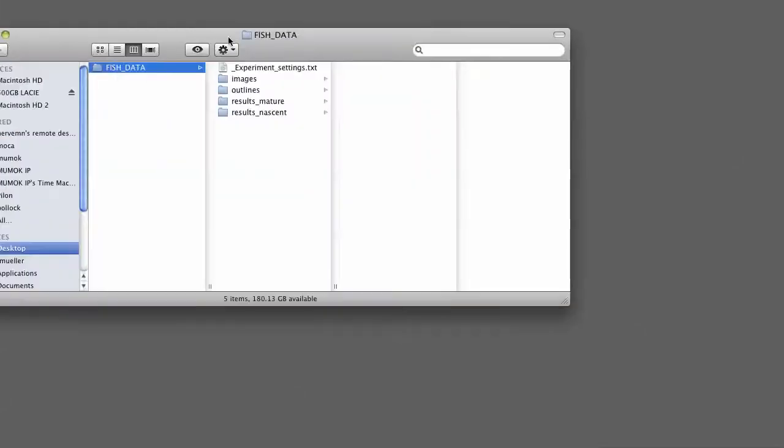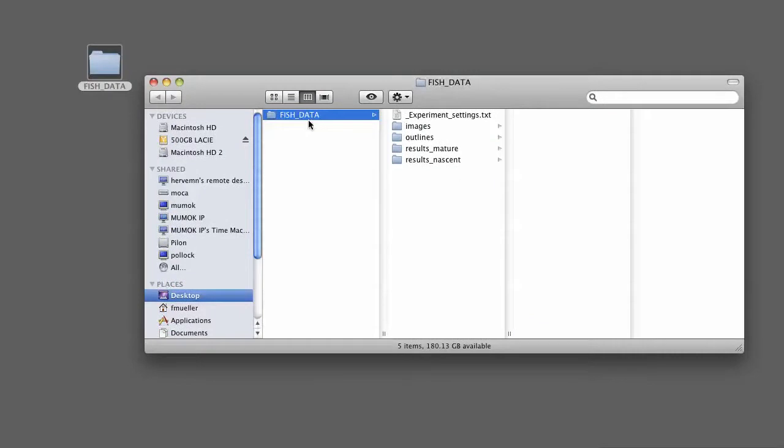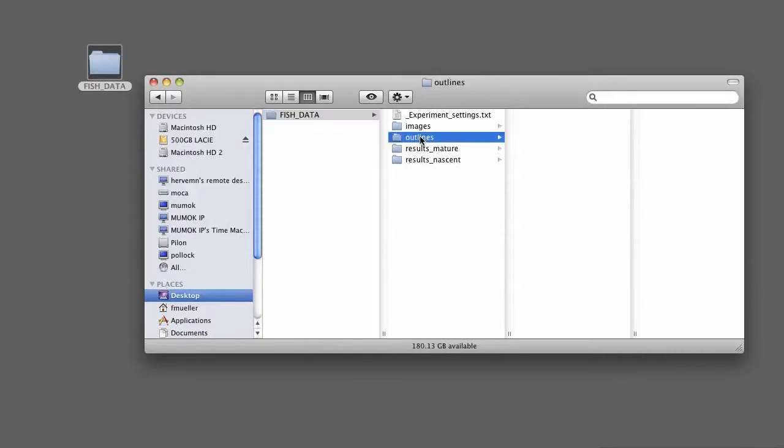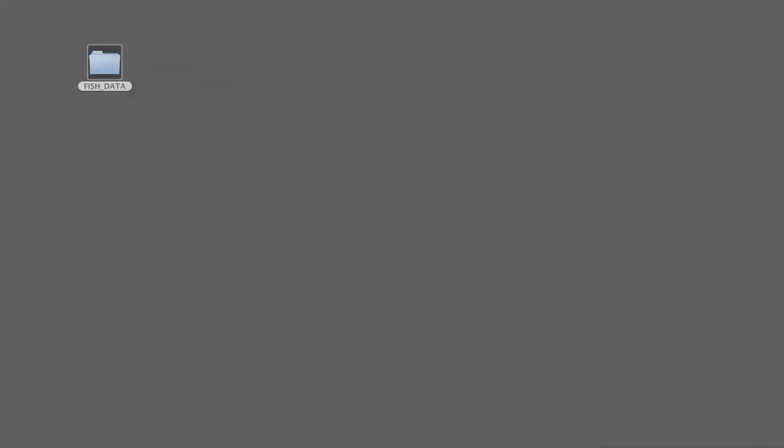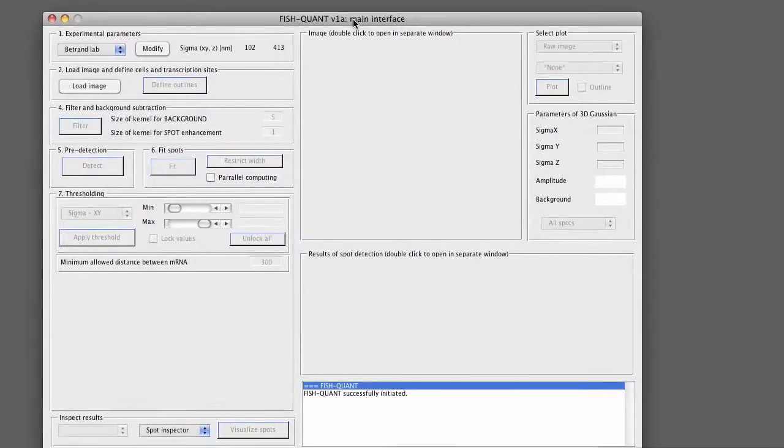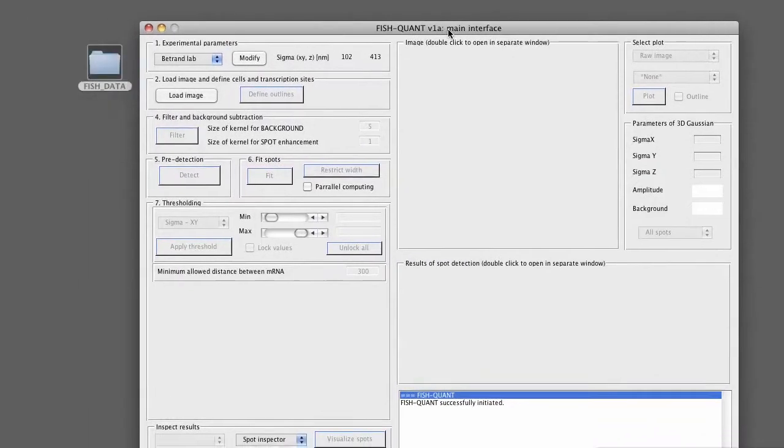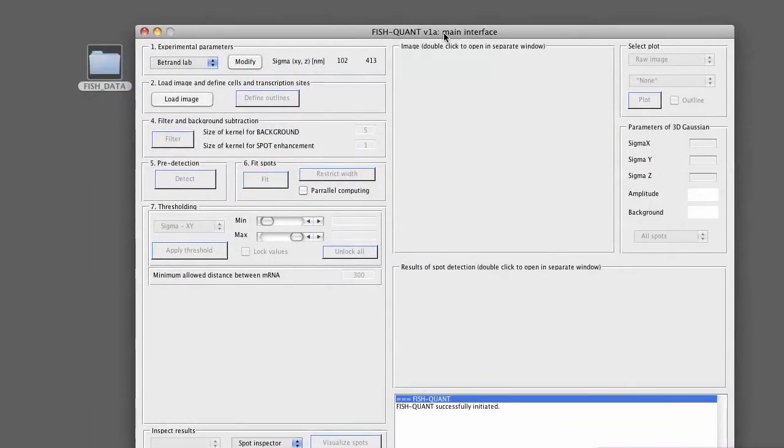We basically continue from the second tutorial where we set up the folder structure. Just as a little reminder, we have a folder with the fish data, where we have subfolders for the images and the outlines, and also for the various results files. In FishQuant, we already specified where FishQuant can find those folders. So we're basically set to go.